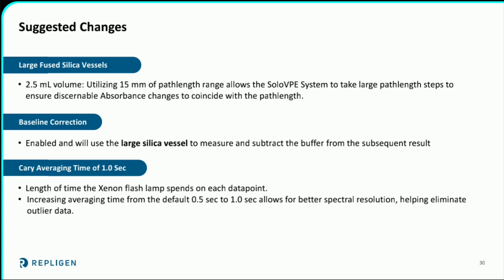So right below that, we have baseline correction, and this is directly involved with the buffer. So any low concentrated sample that has a buffer, there should be an evaluation to see if that buffer actually contributes to the result of your sample. So basically, you measure that buffer 3 times, see if you can get a consistent result, good linearity. And if you do, you would see if that contributes to at least 1% of your sample concentration. So there's a buffer evaluation step that can be used, and if you have a low concentrated sample, it might be very critical to get accurate results.